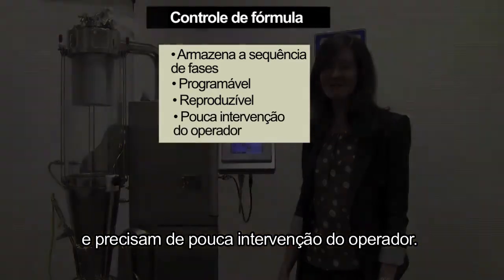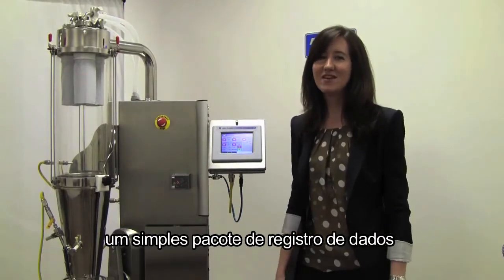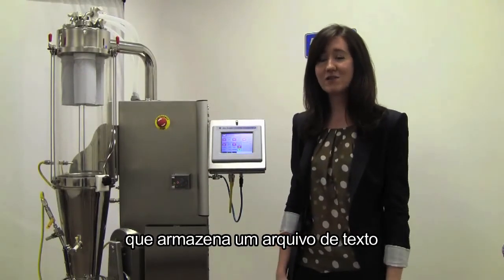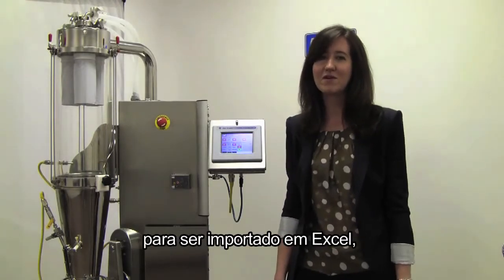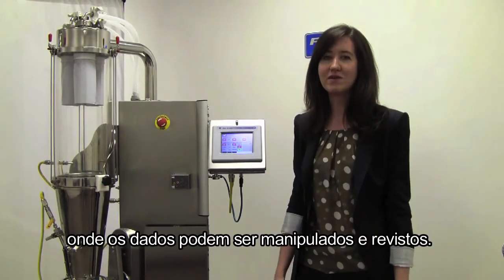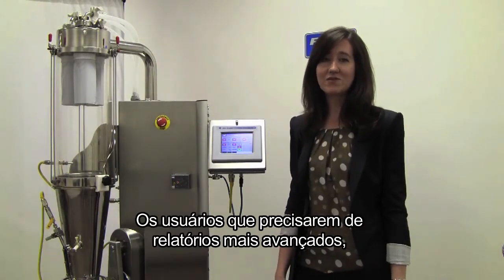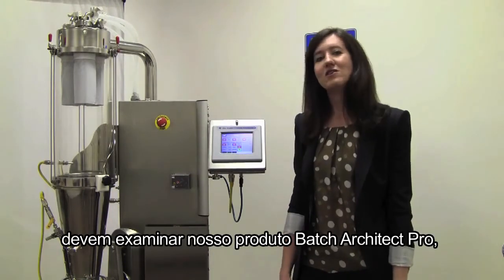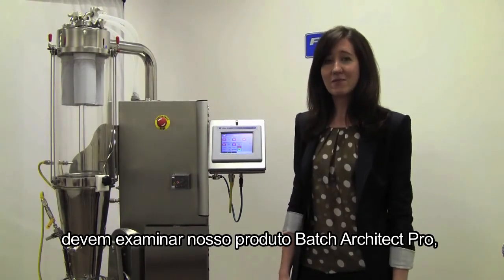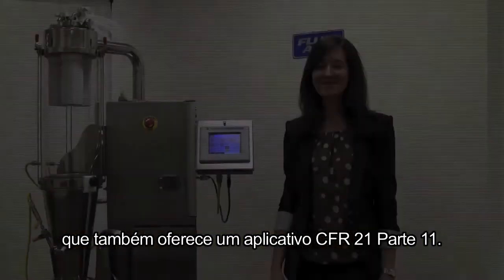The Batch Architect system comes with a simple data logging package that stores a text file to a compact flashcard, which can be removed and placed on a desktop computer for importing into Excel, where the data can be manipulated and reviewed. Users that require more advanced reporting and data logging and recipe control should look into our Batch Architect Pro product, which also offers CFR 21 Part 11 compliance.